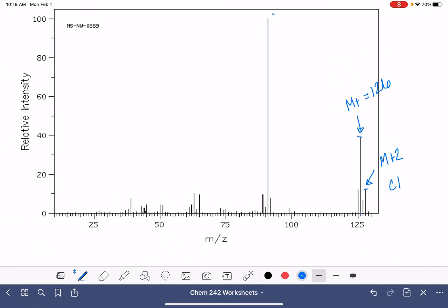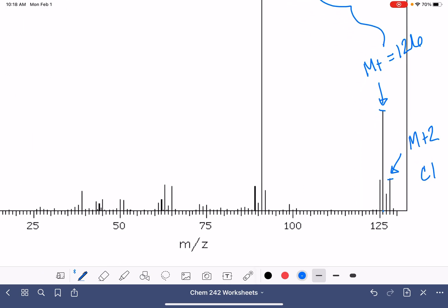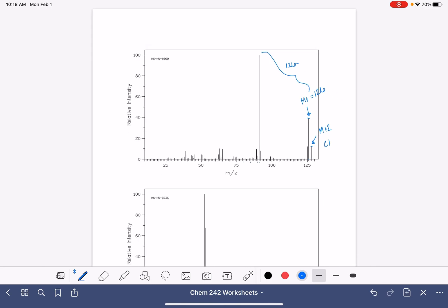Looking at a gap. So our first gap here, 126 going down to 91. 126 minus 91 is 35. That's a chlorine. So again, losing that chlorine, just like we saw in the previous one, losing the bromine.